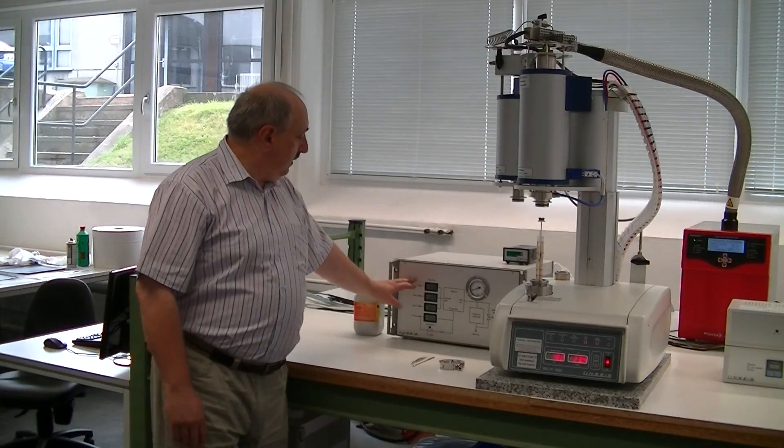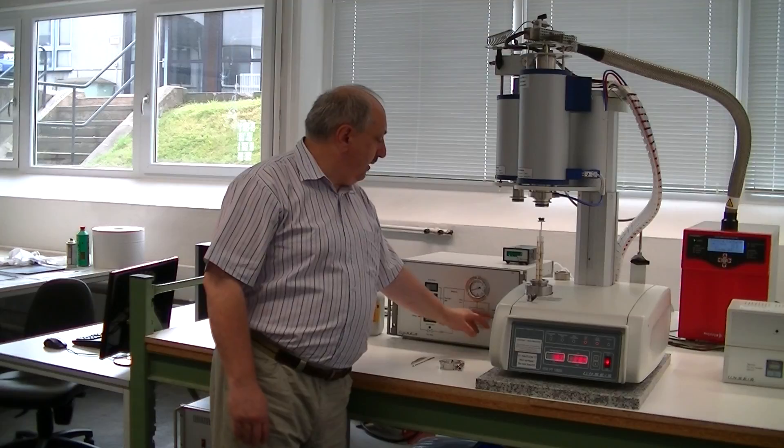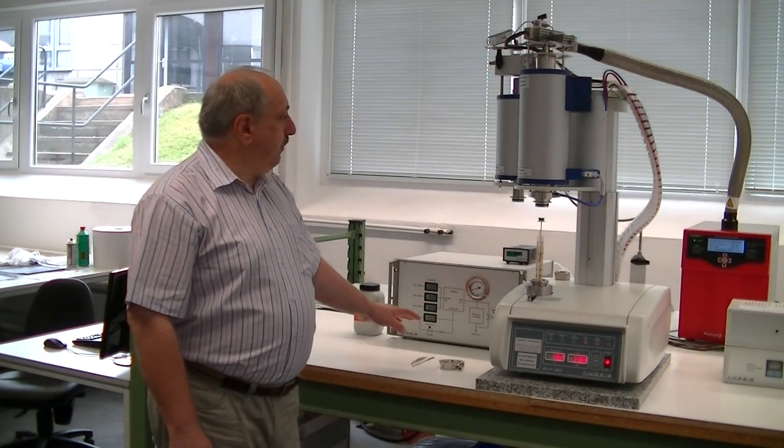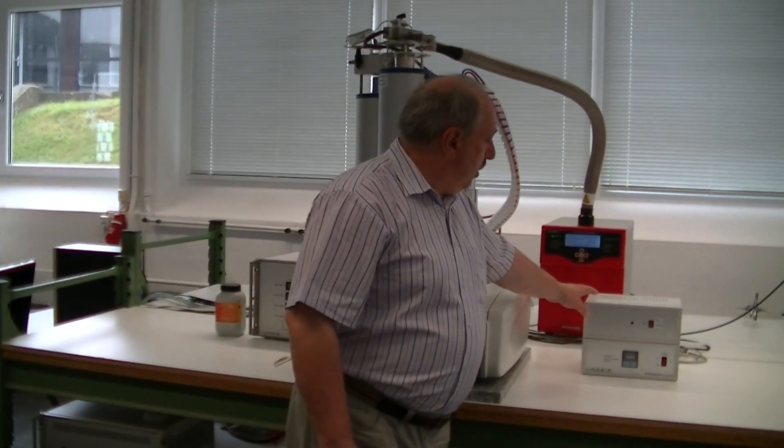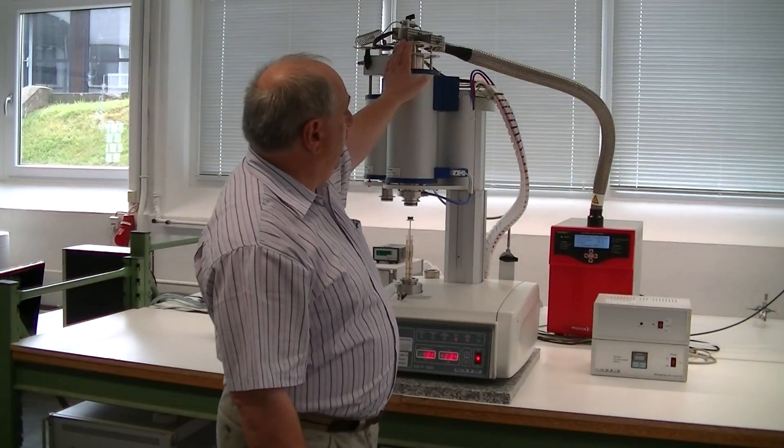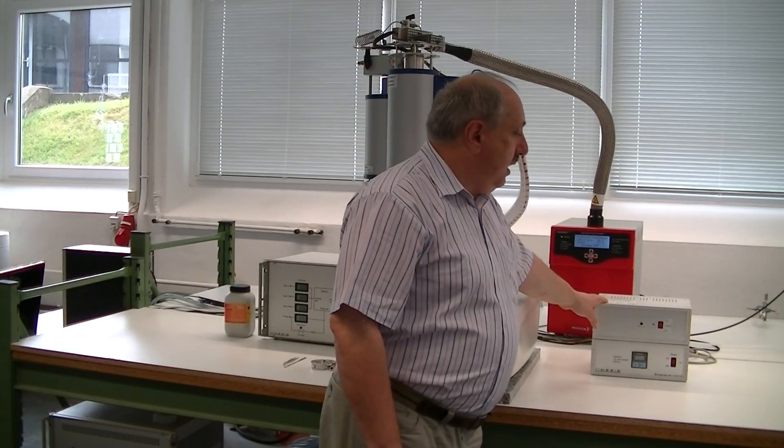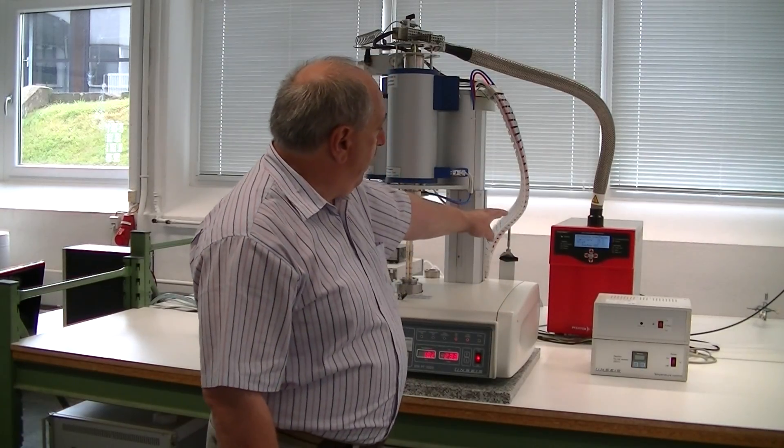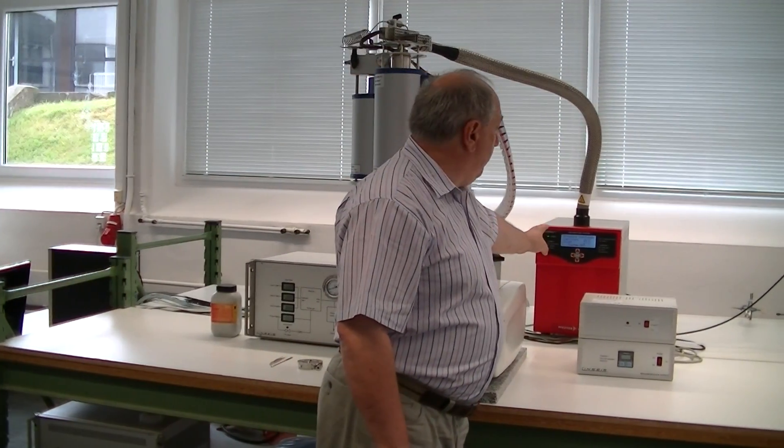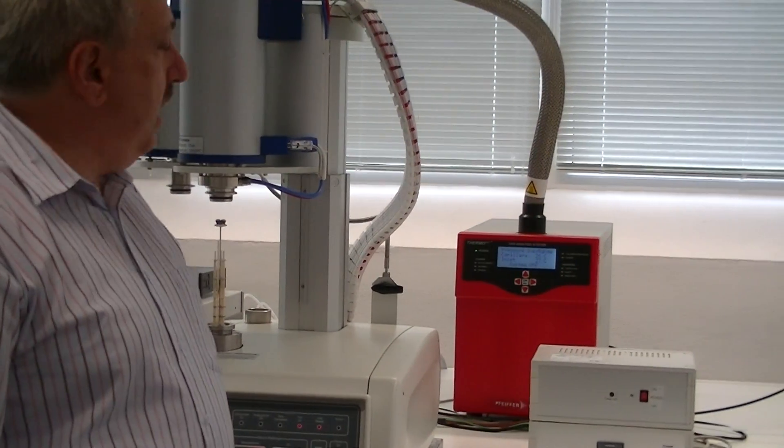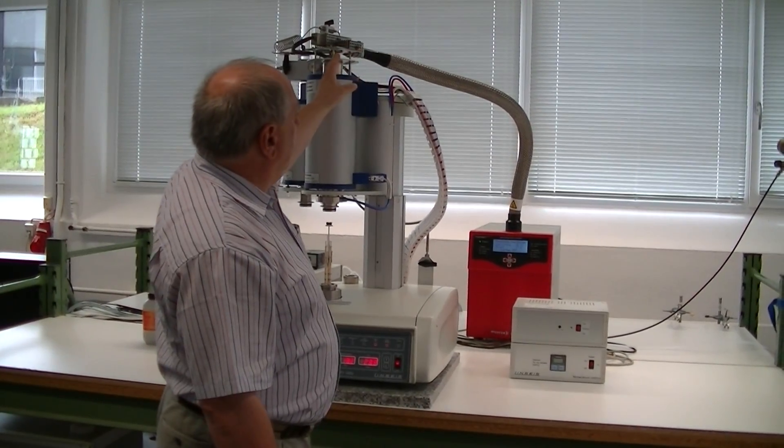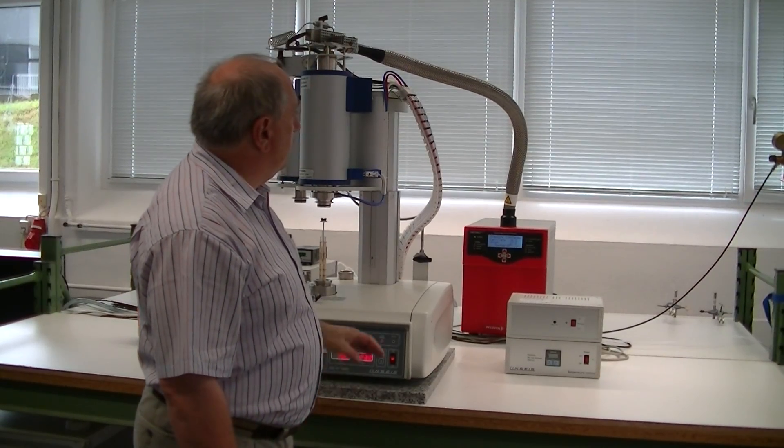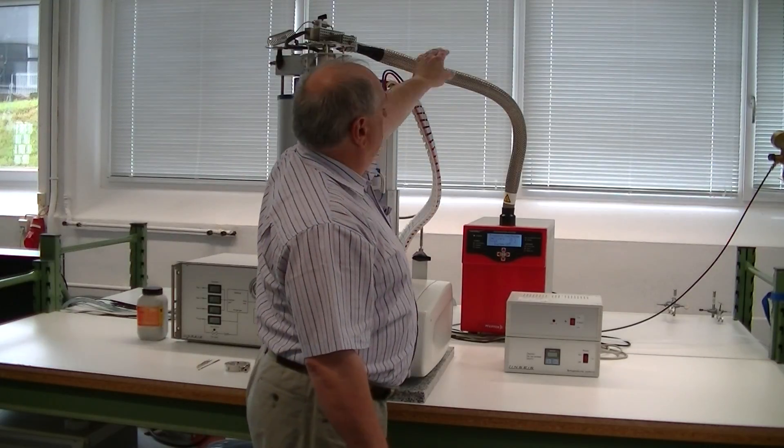You can have different gases, purge gas, and also it is possible to control the pressure inside between minus 1 bar and plus 7 bar overpressure. On the right side, you see two control systems. This is a heated outlet for the mass spectrometer coupling. And the other one is a control system to have a synchronized start from the thermal balance together with the FIFER mass spectrometer. The red machine you see over there is the mass spectrometer from FIFER, can measure up to 300 AMU and has a heated capillary for the gas transport. Maximum temperature is about 250 degrees for the gas line.